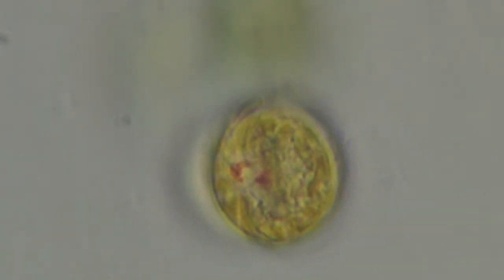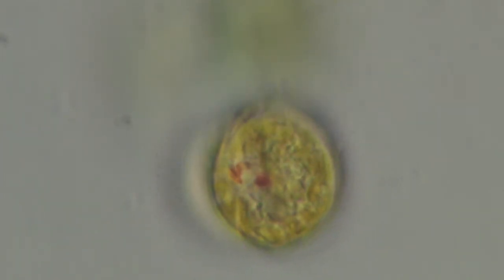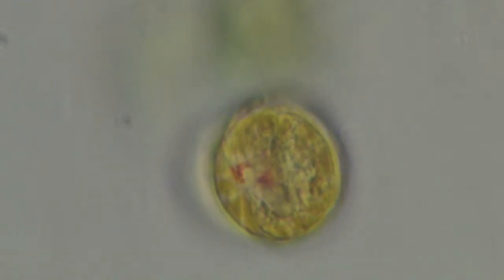I can't remember these guys. There were other ones mentioned along with these when you talk about interesting shapes and stuff, like radiolarians and foraminiferans and all this kind of stuff. They have calcium carbonate shells, but these guys are way too transparent to have much calcium carbonate. They might have a little bit to give them that shape. I have to read up on these guys. I forgot, since I've never seen them except once before. I don't remember that much about them other than the fact that they are nuisances to folks that like to eat the stuff that feed on them. But they are cool little structures.